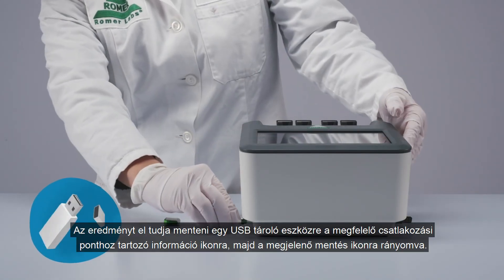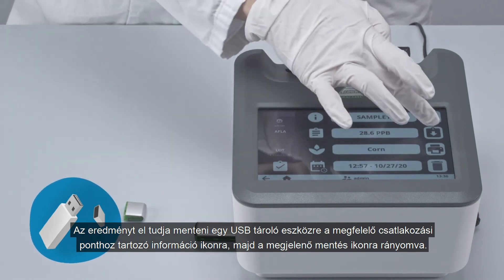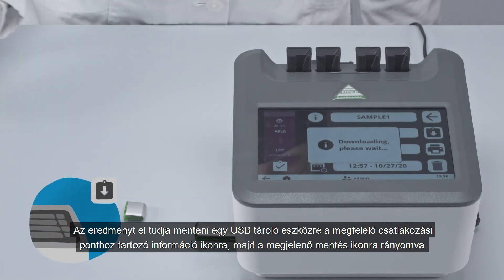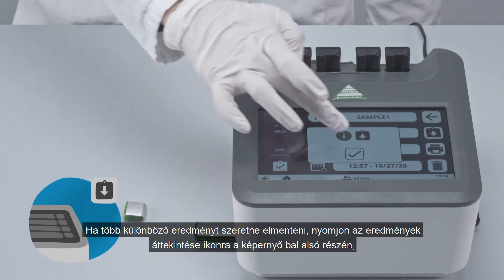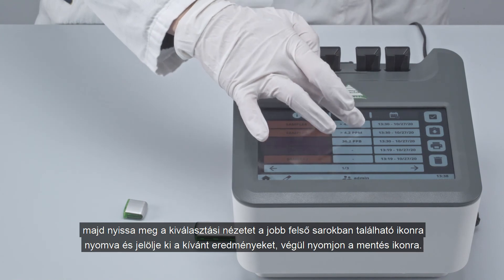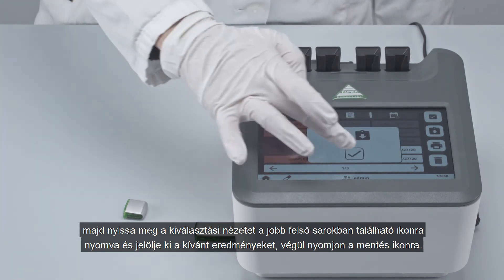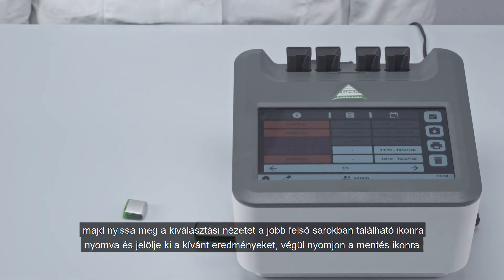The current result can be saved to a USB drive by tapping the info icon corresponding to the relevant port and then by tapping the save icon. If different or more results need to be saved, tap the results overview icon at the bottom left of the screen. Open the selection view by tapping the icon on the top right, select the relevant measurements, and tap the save icon.